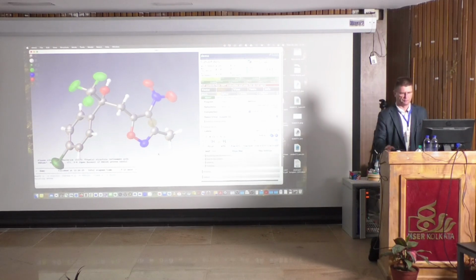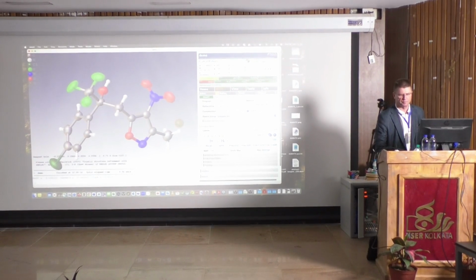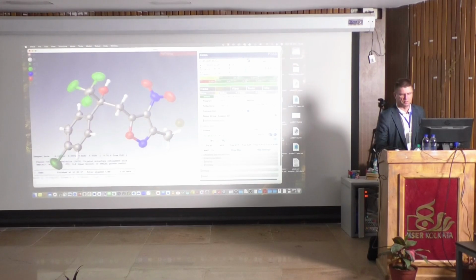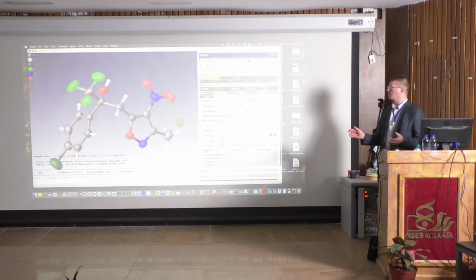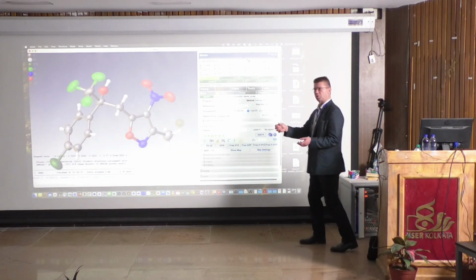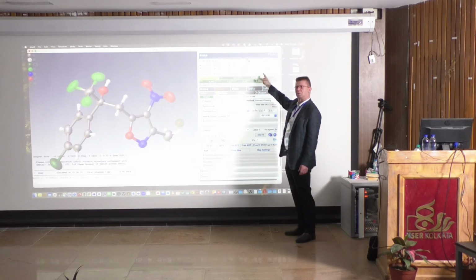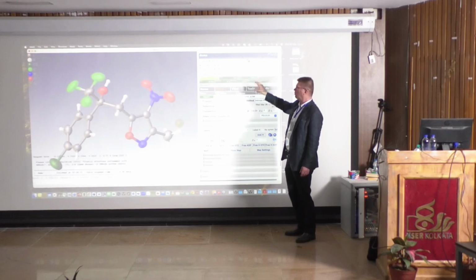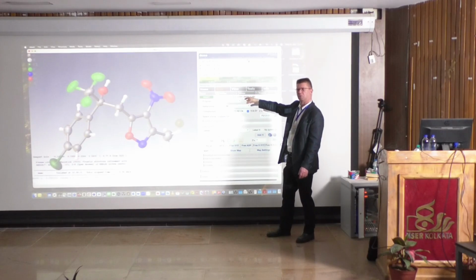Now I repeat a refinement. And now once more. Now everything's green. Now we have done. And adding one hydrogen makes our structure completely incorrect. It cannot be correct chemically. But this number doesn't change virtually at all. So all the numbers were green, everything is fine, except there is the remark.